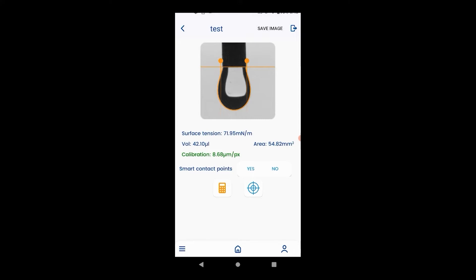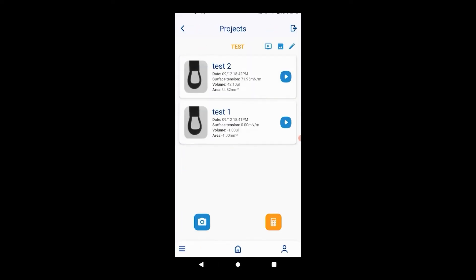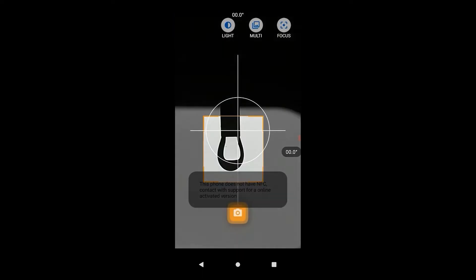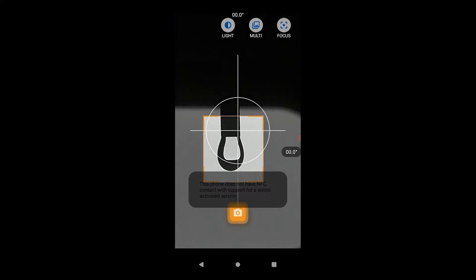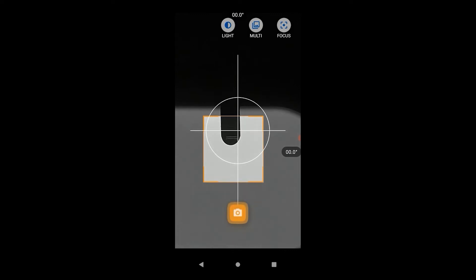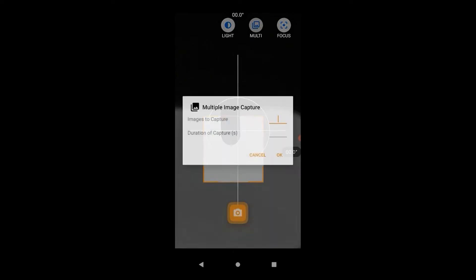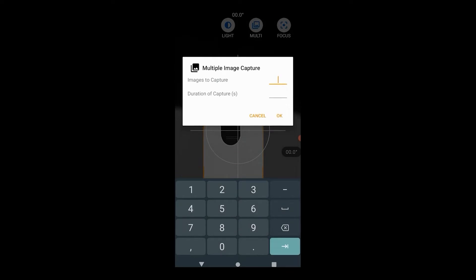The app's multi-capture function can be used to take multiple images in a set timeframe. This can be used as a foolproof way of measuring the surface tension by generating the droplet slowly and taking the image right before it detaches from the needle. It can also be used to measure the dynamic surface tension.